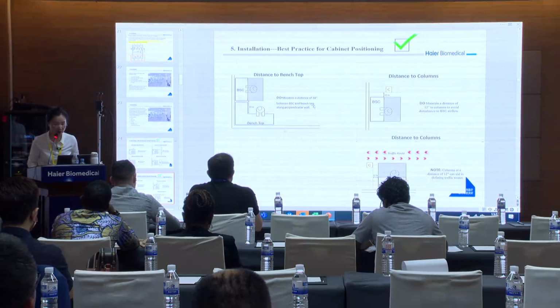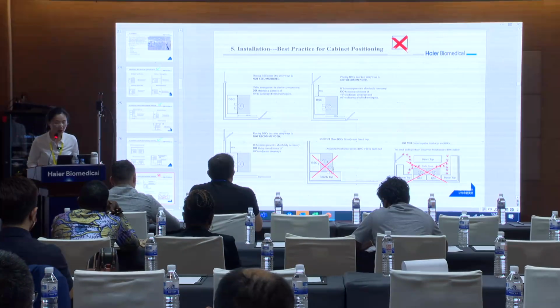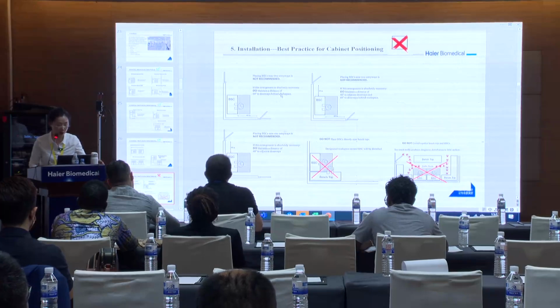So this is another right position we could do, and this one. This is right. Also, like this is right. So this is wrong. So the first situation, this is wrong.